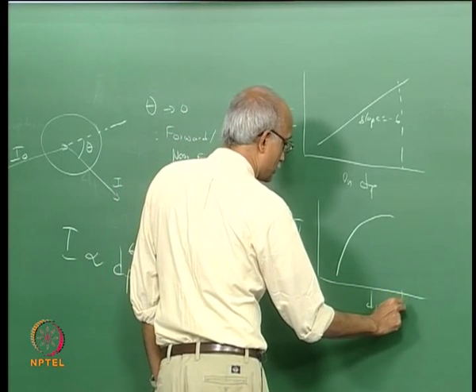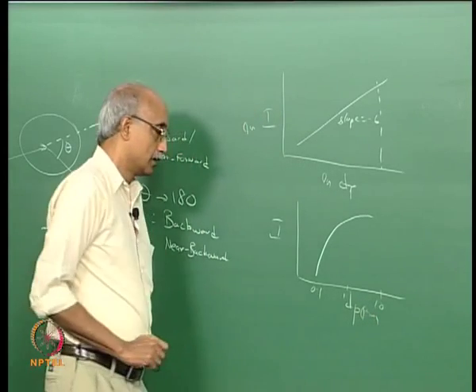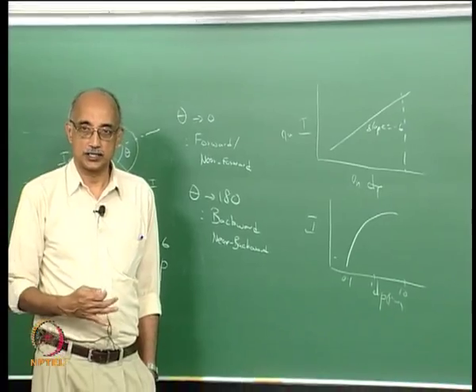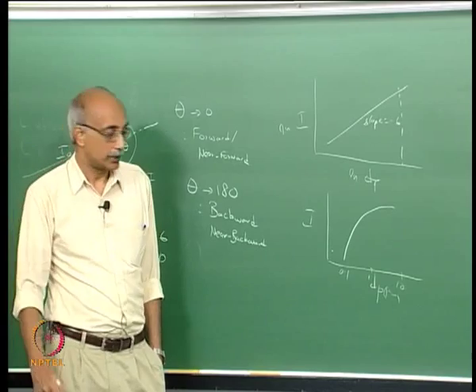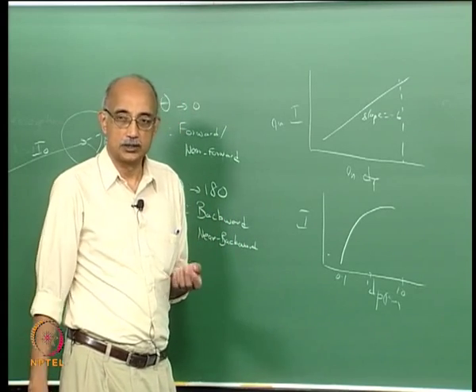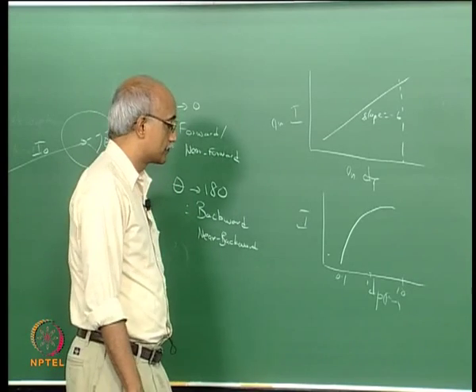So let's say that this is your 10 microns, 1 micron, 0.1 micron. Your light optics that are perfectly fine up to a micron all of a sudden are not going to help you as you approach the sub-micron range. So that's a huge challenge that we will discuss in more detail in future lectures. Suppose you do want to analyze the size of nanoparticles or submicron particles, how do you do it? Because the theory tells you that the scattering intensity drops exponentially virtually. How do you address that problem?